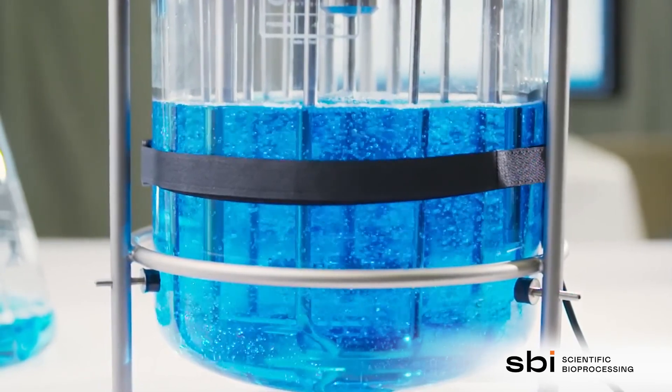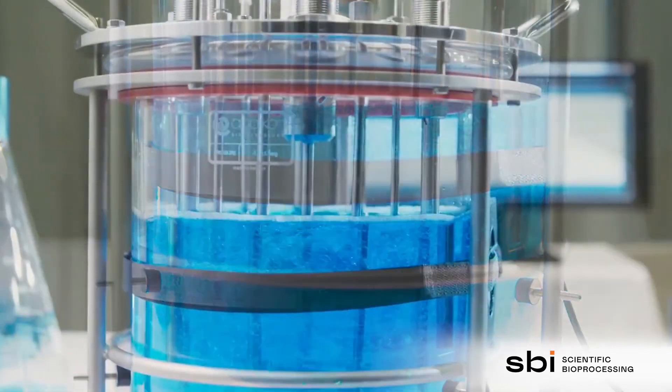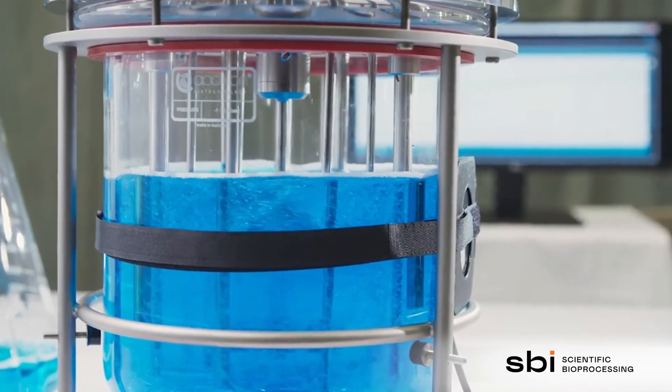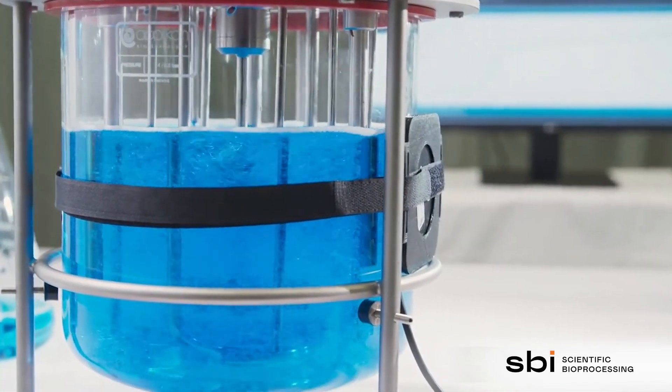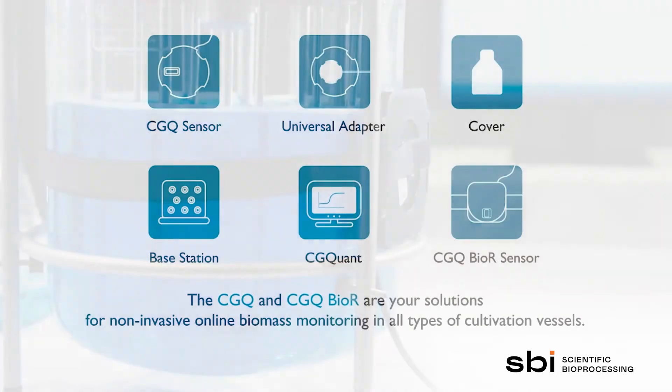The CGQ BioR sensor can be used with various types, sizes and shapes of bioreactors and is attached to the outside of the vessel by an adapter.